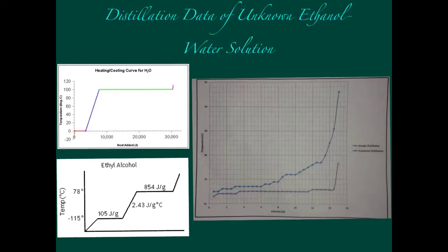The same behavior would be for ethanol, but at a much lower temperature. In this case, it would be 78.5 degrees. However, when we mix our two compounds together, we collect our distillate at lower temperatures. Half of it we would collect at under 79 degrees Celsius. Only afterwards did we see an increase in our temperature relative to the amount of distillate that we received.